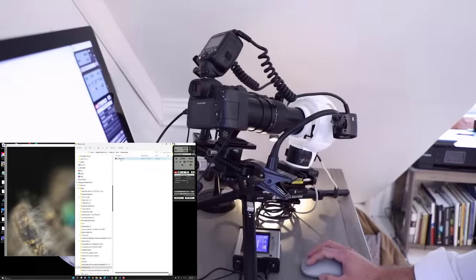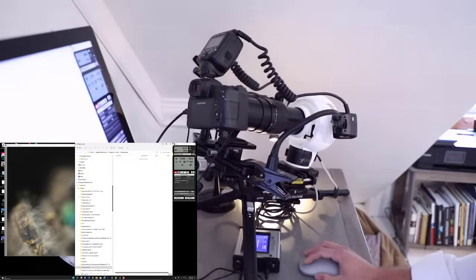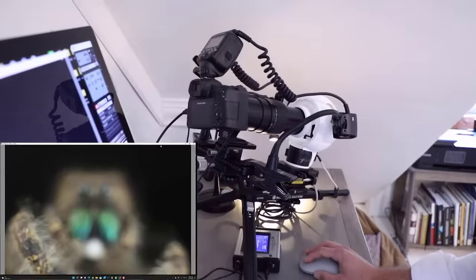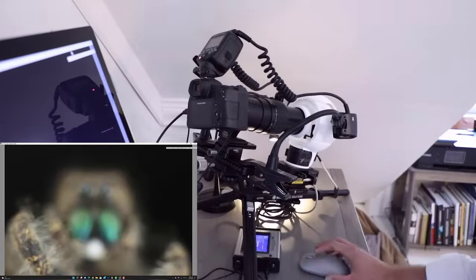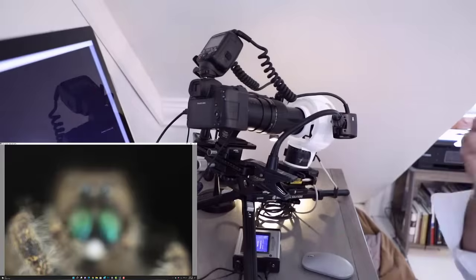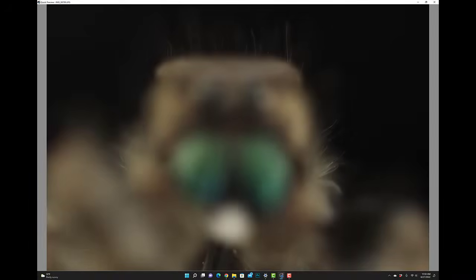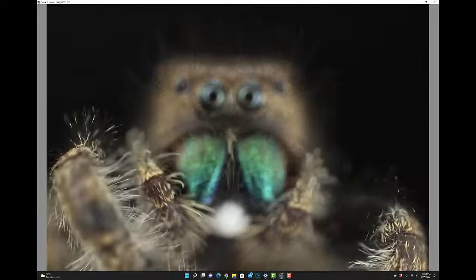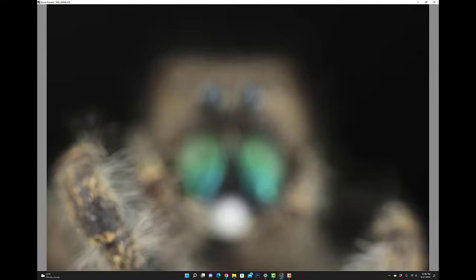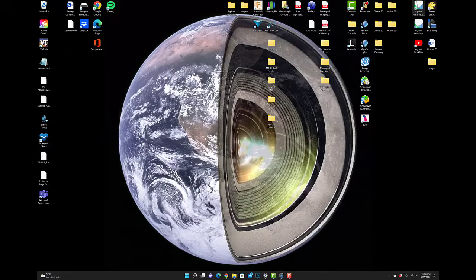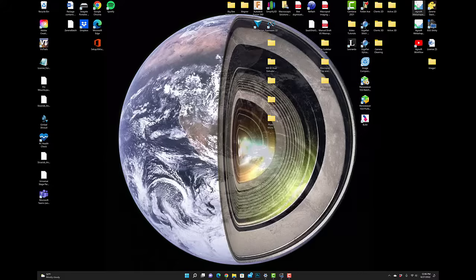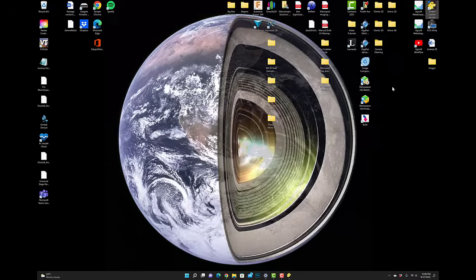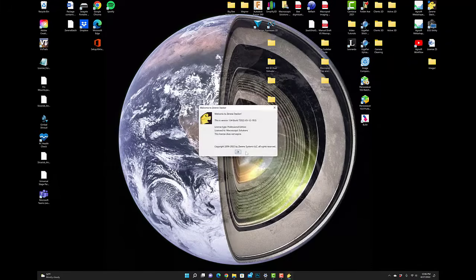Now what we want to do is just delete the test images that we just captured. Minimize that, I'll enlarge this window and we'll press start and we will begin to capture the images needed to complete the stack. All the images have been collected so now we're going to minimize this. We're going to kill power to the flash, kill power to the camera, open up Zerene Stacker and begin to focus stack those images.